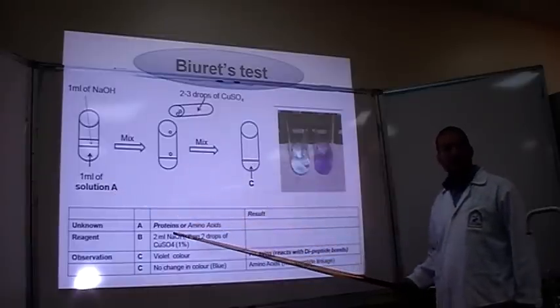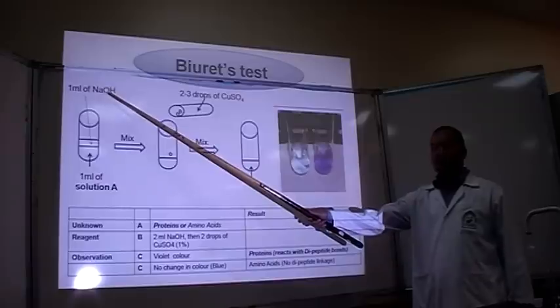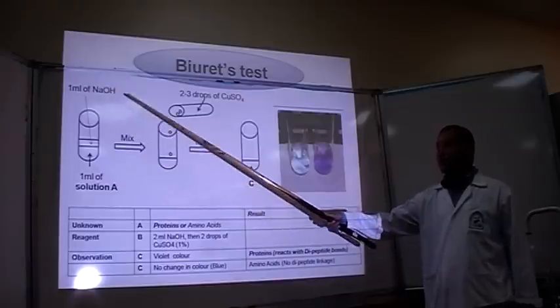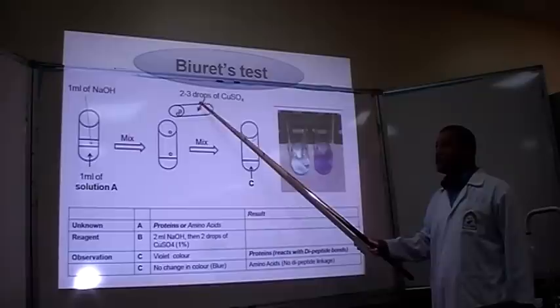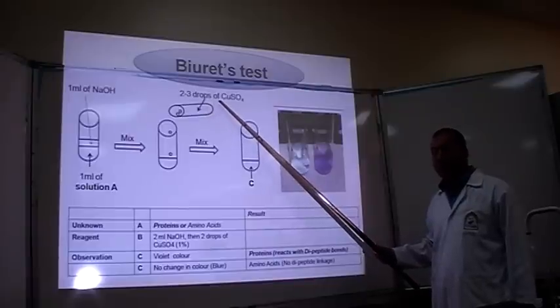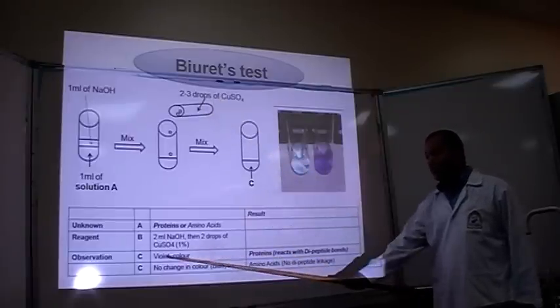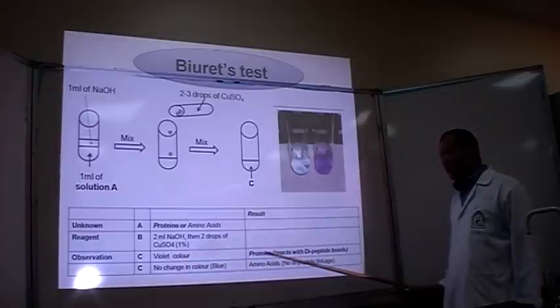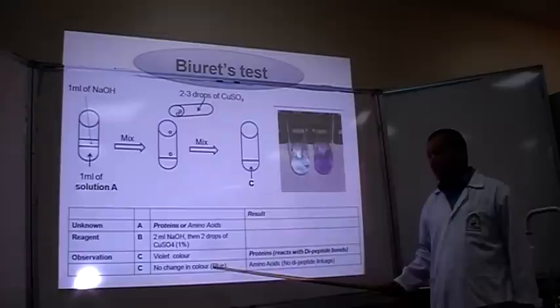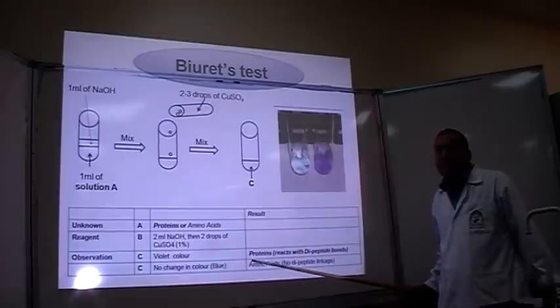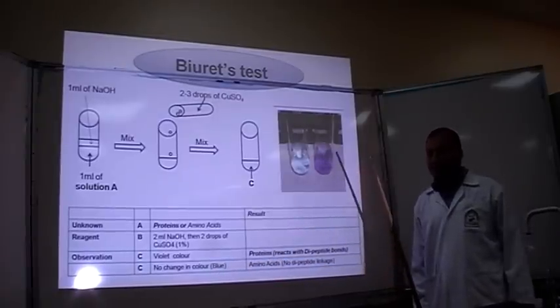To do the experiment, take one ml of your solution — egg white, protein, or amino acids — then add NaOH to make the medium alkaline. Mix, then add two drops of copper sulfate to form the complex. In the case of proteins, you get a violet color, meaning proteins are present. If you don't get a violet color, that means you probably have amino acids. Now let's start doing the experiment.